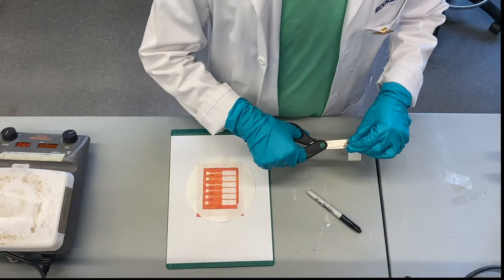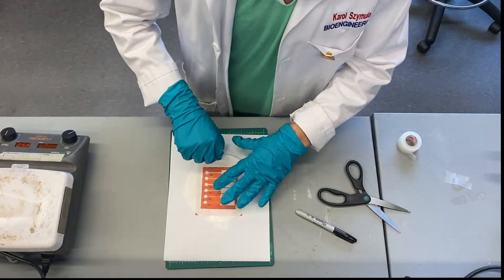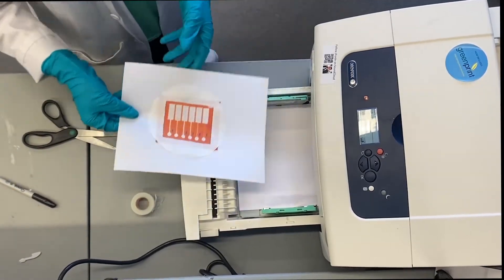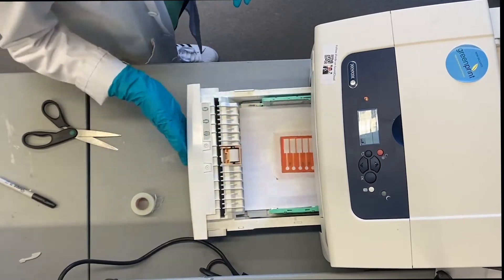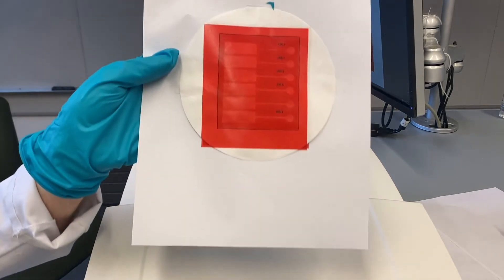Add wax backing to the microfluidic device: The baked device will be mounted onto an alignment sheet for the wax backing. The backing is necessary in order for the devices to run.